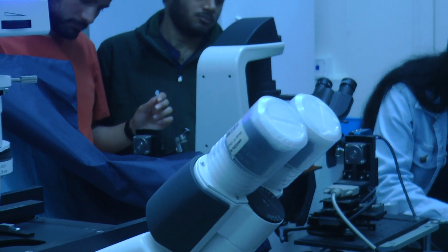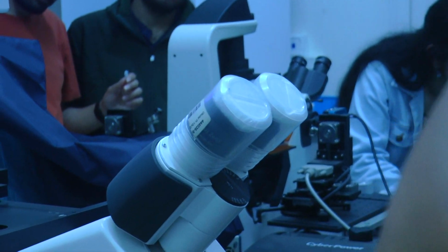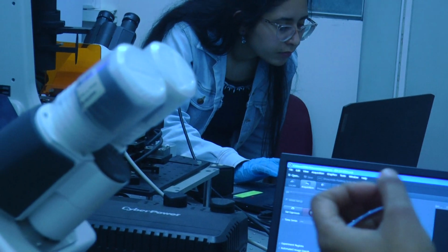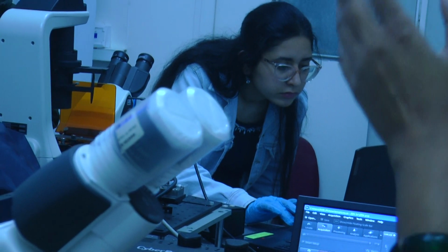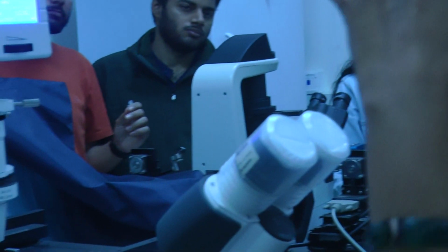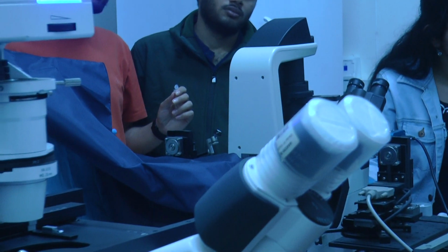There is a dimple in the center and there is a bulge in the edge. So normal cells, which is for 0.9%, you'll actually see the dark region in the center and bulge in the outside. But for 0.6%, everything looks bright and it looks like a bloated balloon. And for 1.2%, you'll get these spicules where it's shrunk and they are crenated.